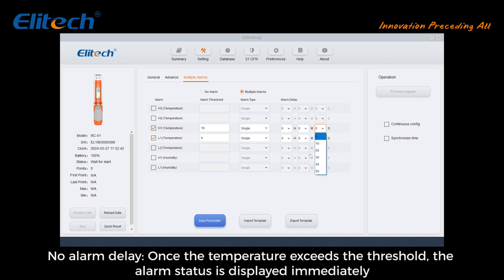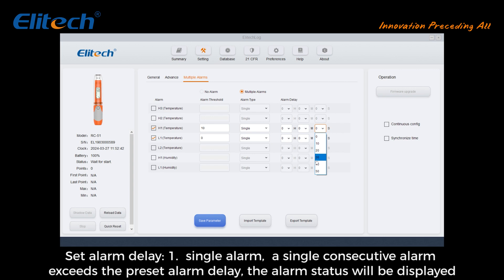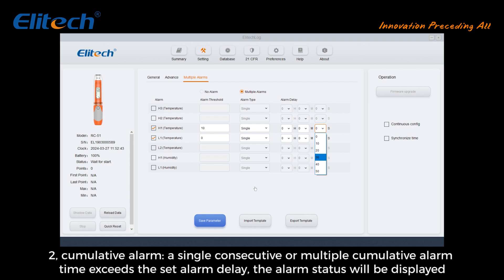Set the alarm delay — how long the alarm lasts beyond the limit. With no alarm delay, once the temperature exceeds the threshold, the alarm status is displayed immediately. With alarm delay set to single alarm, a single consecutive alarm exceeding the preset alarm delay duration will trigger the alarm status to be displayed.